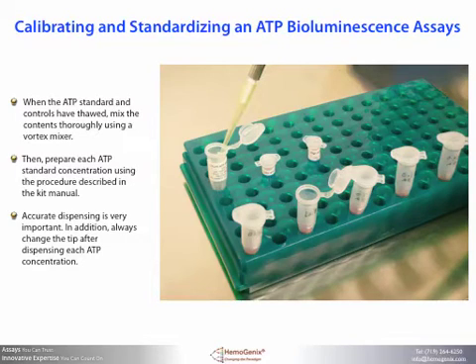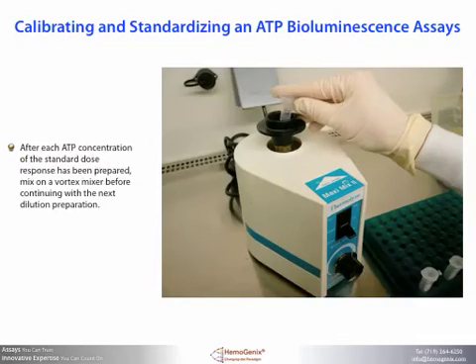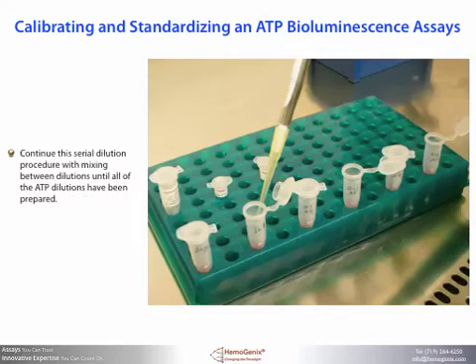Accurate dispensing is very important. Always change the tip after dispensing each ATP concentration. After each ATP standard concentration of the dose response has been prepared, mix on a vortex mixer before continuing with the next dilution. Continue the serial dilution preparation with mixing between dilutions until all of the ATP dilutions have been prepared.